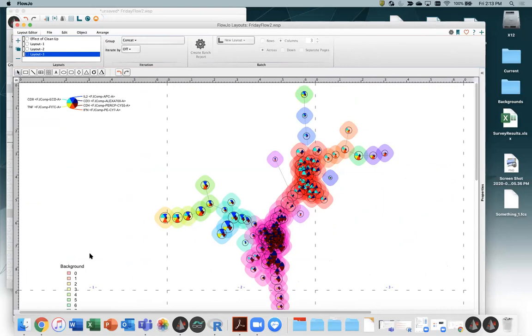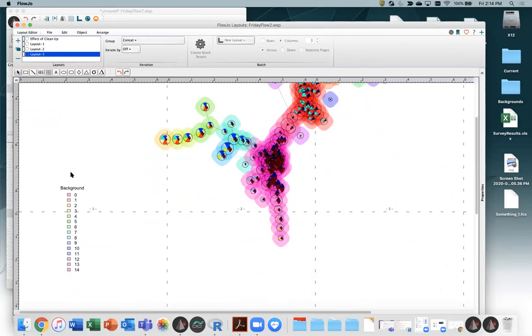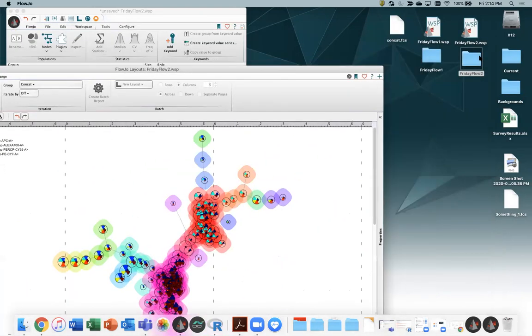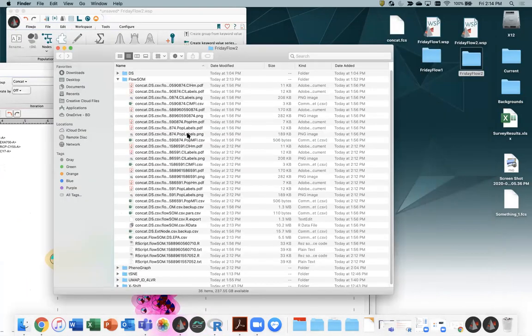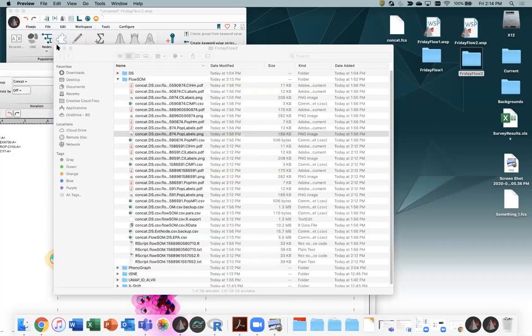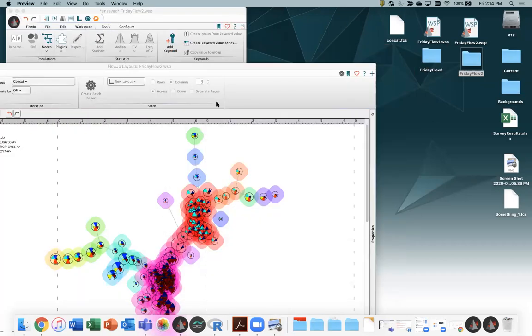Okay, so amongst the files that we get, a bunch of heat mapping and so forth, and then a little explanation of this. We asked it for 15 clusters. Those clusters are identified by the colors, so various reds through pinks here with greens and teals. As you get to larger numbers, it gets very difficult to see the difference between, say, 4, 5, and 6. And that's maybe why you wanted to bring up that plot that identified exactly which one from the outputs here. Pop labels. Sorry, attempting to double click. So 4 was here. 5 is actually an outlier. 6 is in here, with a really small one. I remember that now.